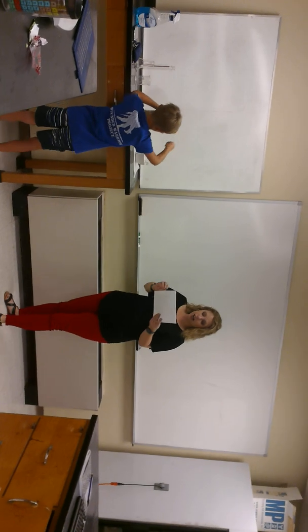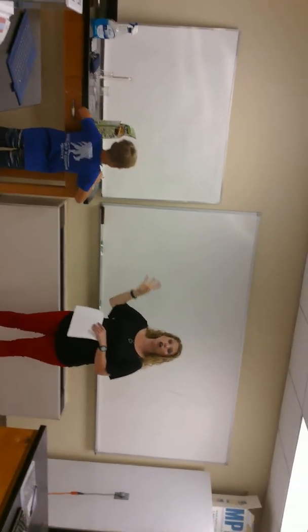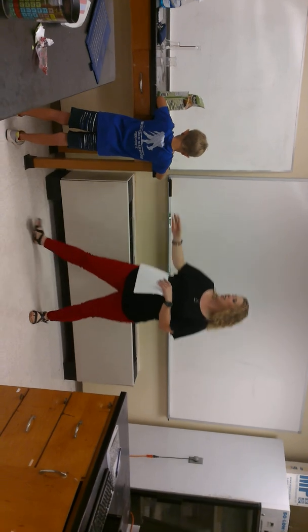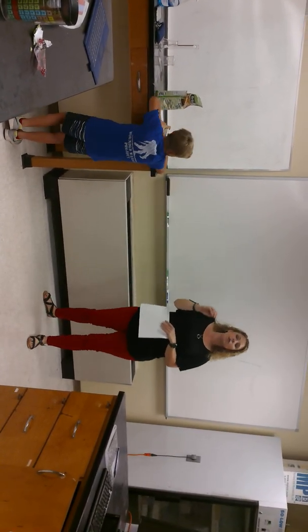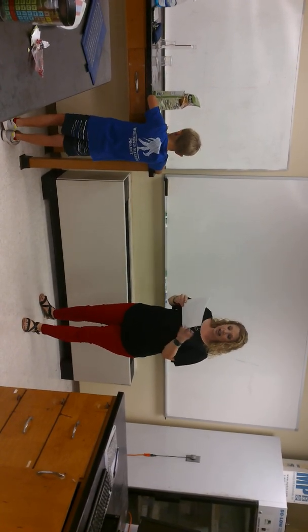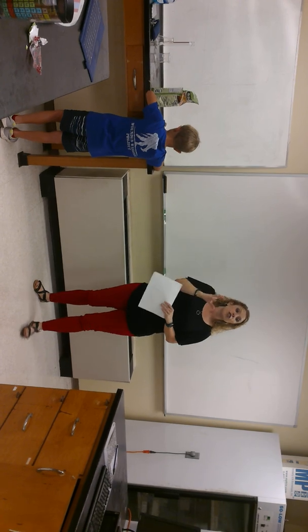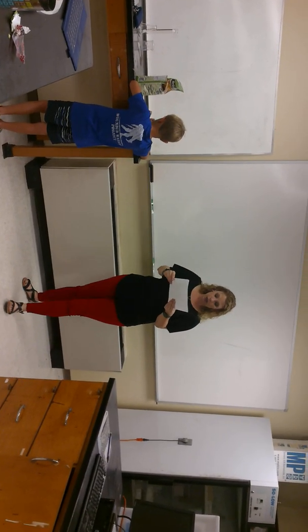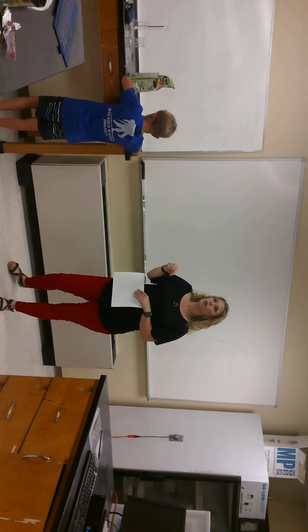And it's very, very important that you get the exact mass of the fertilizer that you use because you're doing a percent. So it's going to be very important that from the beginning, you have an exact mass. So you need to know exactly how much you're starting with. So once you get your exact mass, be sure you put it in the data table. You're going to put that in your beaker.